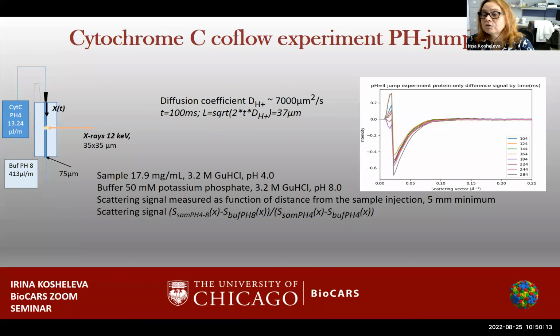And you would think that potentially, if you do not use caged materials, we can put some inserts, like Louis Pollock is developing right now, which would mix buffer and the sample quickly. But I don't remember last time when Kara was talking about that.